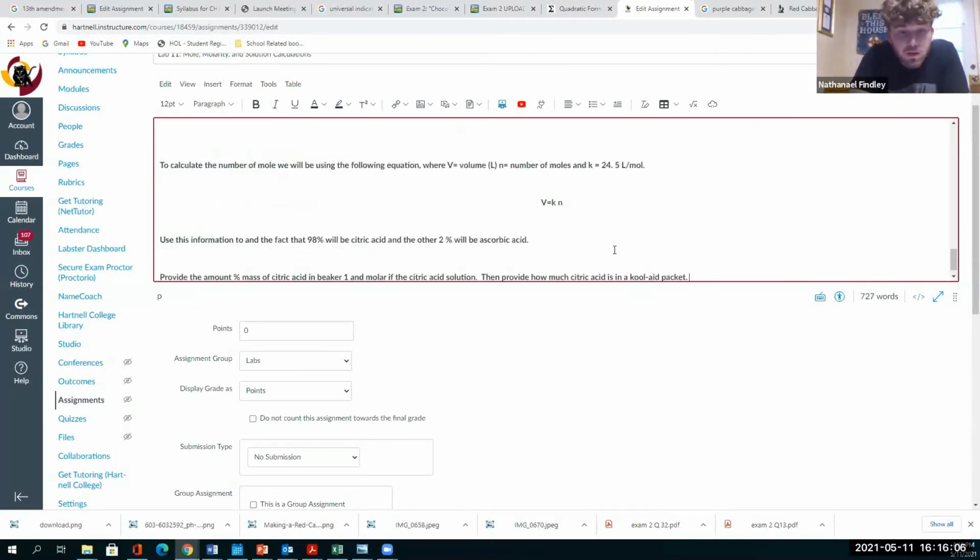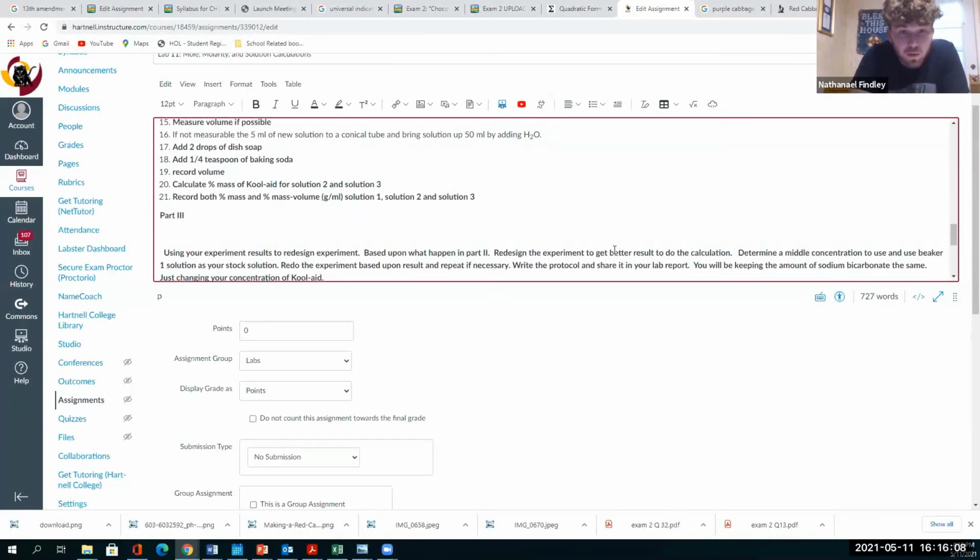Dr. Henry, what do I do with the vinegar part? I didn't follow that part. Okay, so what you're going to do with the vinegar part is that you're just going to test the pH of the vinegar. So you want to test the pH of your Kool-Aid. You want to be sure that your indicators are working, right?